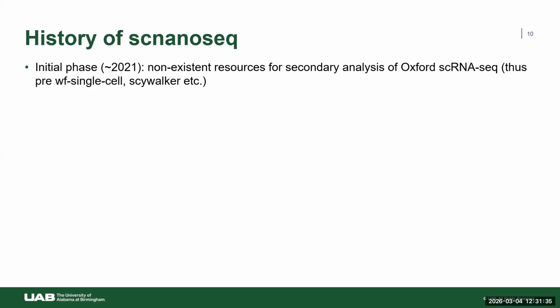because in this time frame, Oxford Nanopore had released a new chemistry that really improved their quality scores a lot. One thing that long-read technologies typically suffer from is quality. But at this time, they released a new technology that allows us to have at least Q20 plus Phred quality scores in their single cells in any type of sequencing. Now, that doesn't mean you always get that quality score. You still get some that are below. I've seen this myself, so you would want to filter anything that you see fit. But that was a lot more promising for single cell.